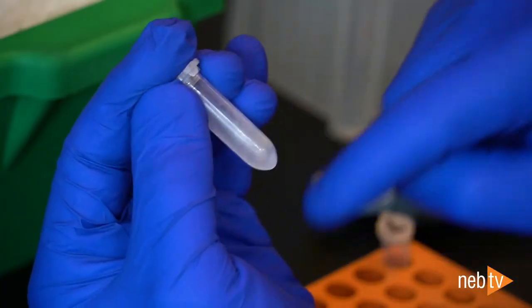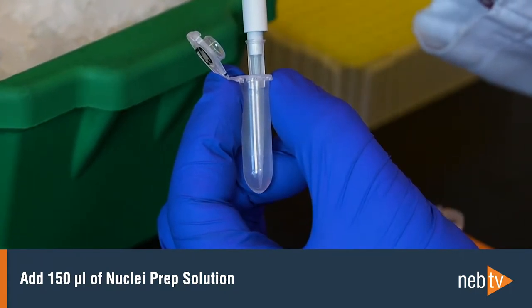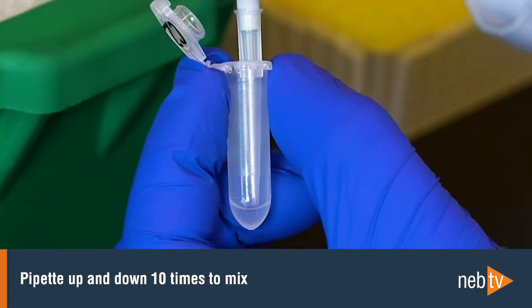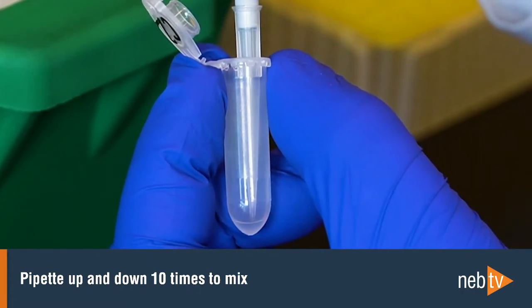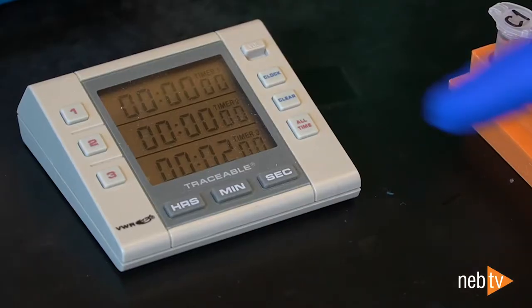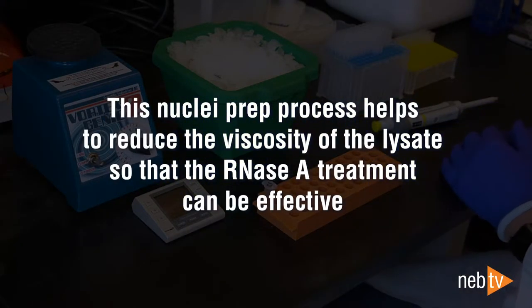Flick the tube to re-suspend the cell pellet and add 150 microliters of the nuclei prep solution. Pipette up and down 10 times to mix, being careful not to introduce air bubbles. The sample will become less turbid, indicating that the cells are lysing, but the nuclei will remain intact. Then incubate at room temperature for two minutes. This nuclei prep process helps reduce the viscosity of the lysate so that the RNase A treatment can be effective.